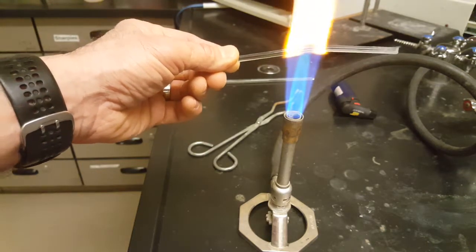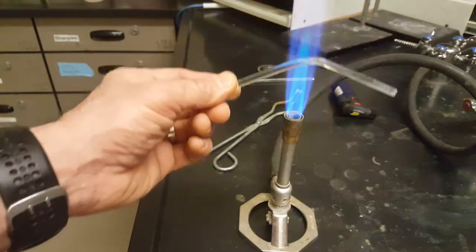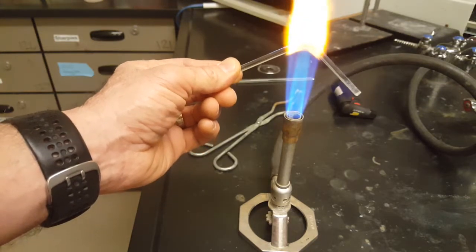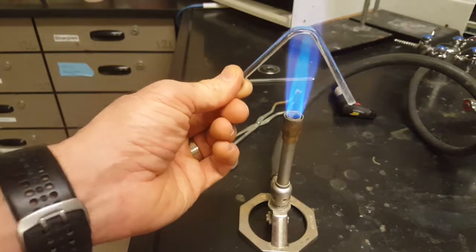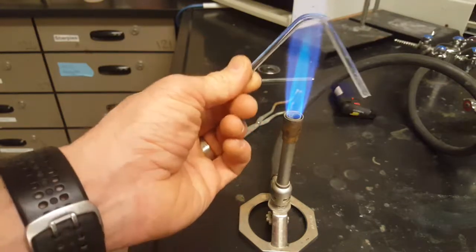If you heat it in the middle, the weight of the glass itself will bend the glass, and you just pull it out. My fingers aren't feeling any heat in the glass at all where I'm holding. Of course, if I touched it where it was bending, I'd be burned. So be really, really careful.